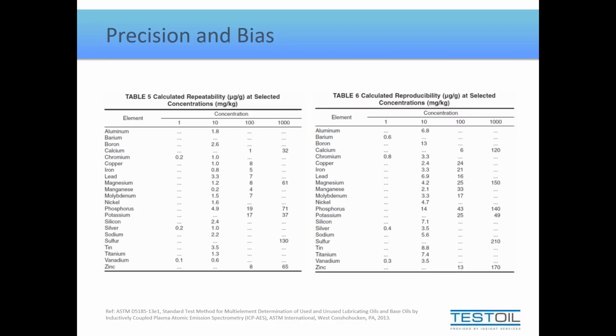So what I'm trying to illustrate here is that when you look at consecutive samples, arguably, to a point, you can use the reproducibility values as an indicator of how much deviation you should expect from any 2 results, assuming there are no changes, which of course you know there's going to be some change. So what I'm driving home here is that a few parts per million deviation from one result to the next is actually well within the error of the method, the noise on the instrument.